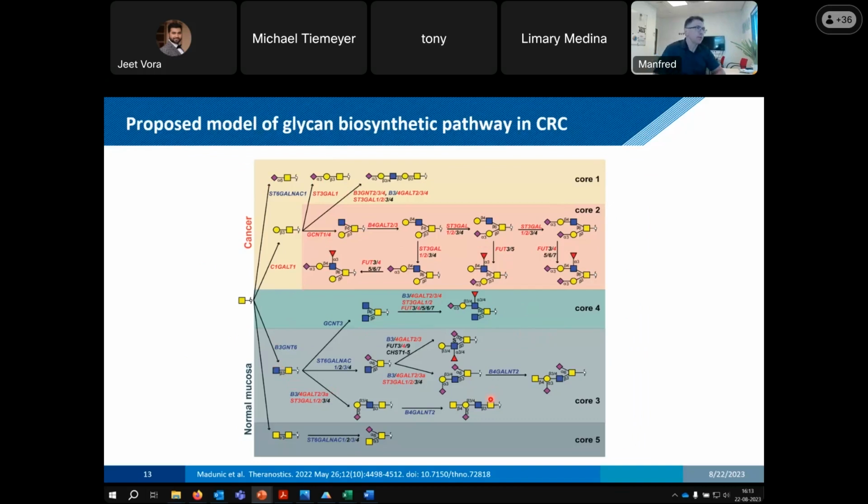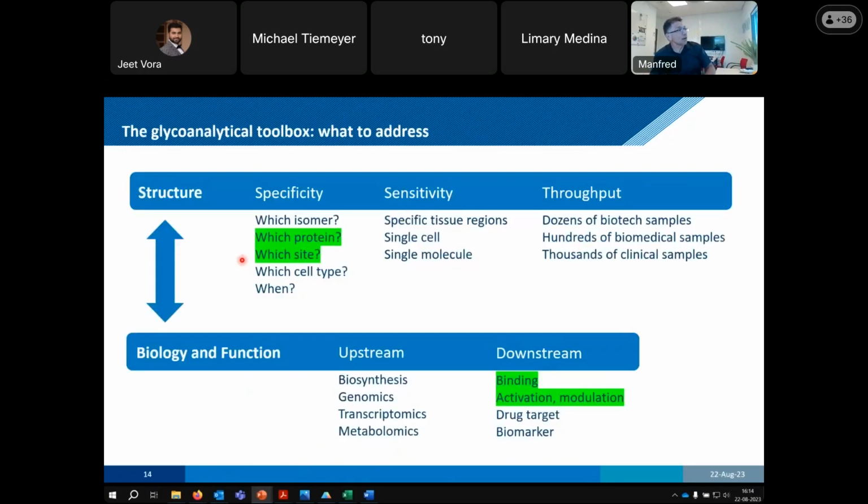So, what is the way forward now with this? We were encouraged to develop therapeutic antibodies. Hopefully, this will help then to fight maybe advanced cases of colorectal cancer, maybe even metastases. So we're also looking whether metastases have a similar glycomic signature. Okay, so this is all I wanted to show on colorectal cancer and tissue-specific glycosylation.